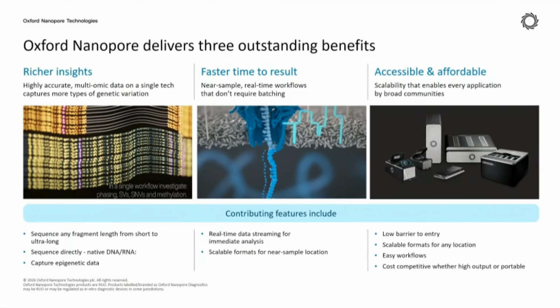So we put the samples into the sequencing machine, and within 1 hour or more, we can start seeing the data coming out from the sequencing, and then we can start analyzing the data. This also helps us to observe the status of the sequencing. For some applications, we can decide when to stop the sequencing based on the available data, and this can help us cut down the sequencing time and also the sequencing resources.